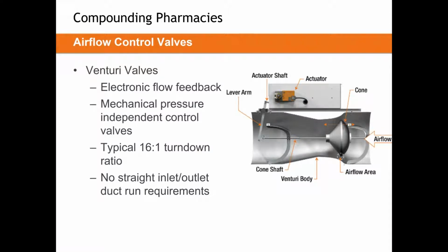So what we are seeing most often on a bio cabinet is actually a 2-position Venturi valve. Inside that enclosure, we would just have a very simple relay system rather than a full controller, which means this valve can be open to some preset set point, let's say 500 CFM, or it can be closed down, often to 0 CFM in the full shutoff position. Nothing exists in between there.